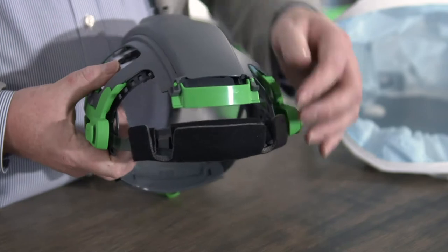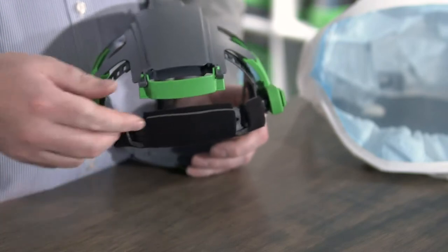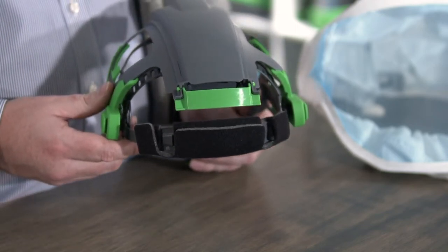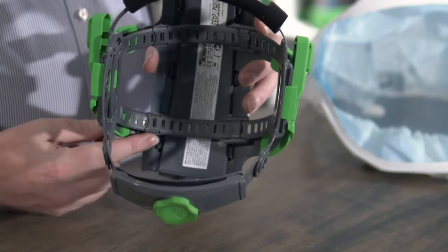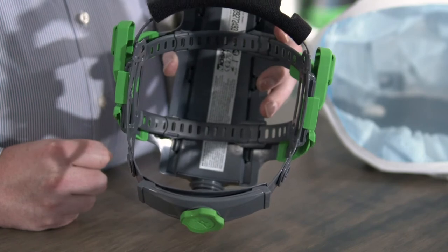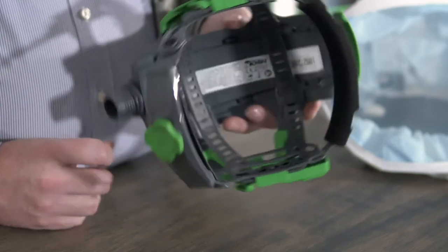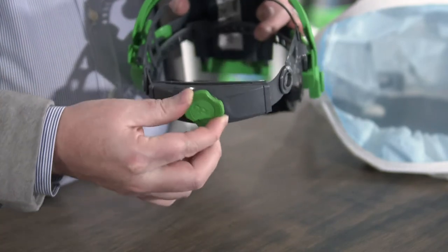You also have the ability to adjust the direction of airflow within the T200. Adjusting the vent will channel the air either over the visor or more over your face, whichever you're most comfortable with. There are also straps across the top of your head that you can adjust to give the head suspension more depth, or if your head is smaller, to position it higher. Finally, you have the ratchet adjustment at the back to tighten the head suspension onto your head.